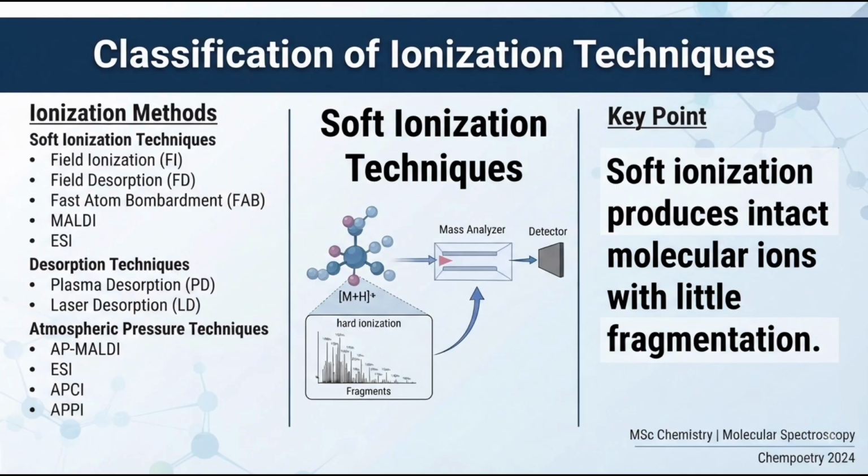Let me ask you a question. If I want to determine the molecular mass of a compound and I want the molecule to remain largely intact, should I prefer hard ionization or soft ionization? Give me the answer below in the comment box.